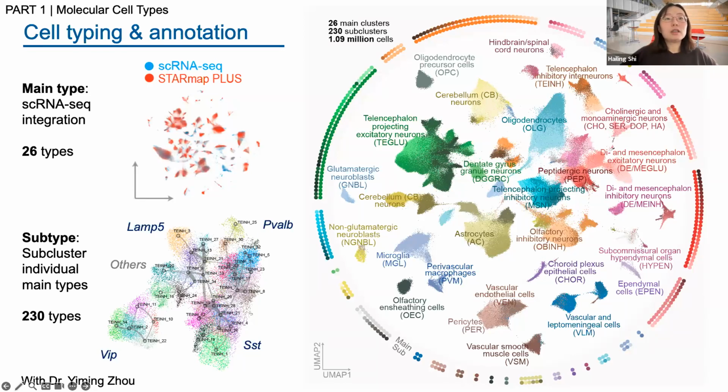And then for finer diversity, we cluster based on the spatial single cell data we have ourselves. There are steps filtering out very lowly expressed genes from the gene list for the sub-level cell typing. This is related to the challenge of cell segmentation for imaging-based spatial transcriptomics.